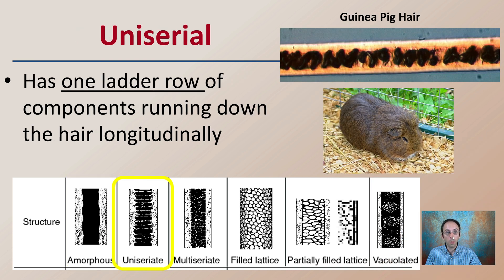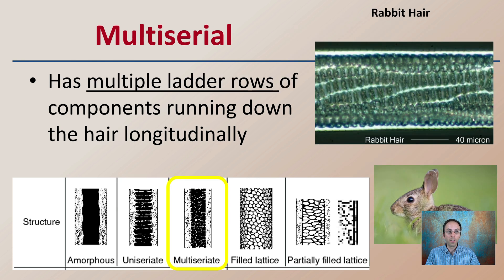The uni-serial medulla has one lateral row of components running down the hair longitudinally. An example of that would be guinea pig hair, where we can clearly see that uni-serial pattern in the medulla.